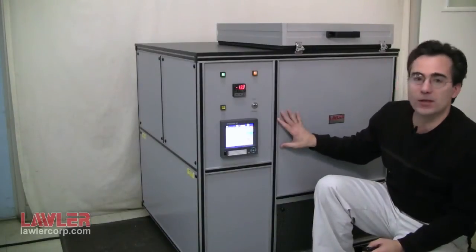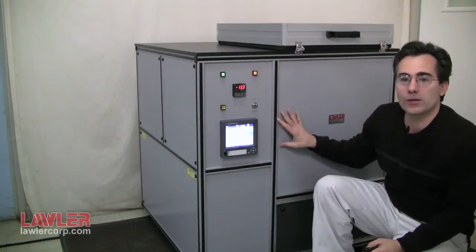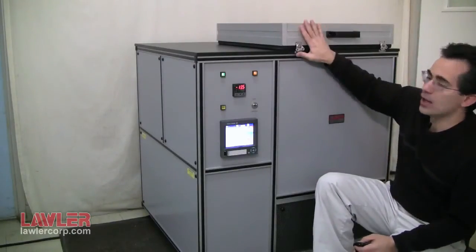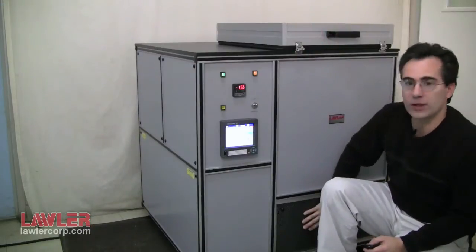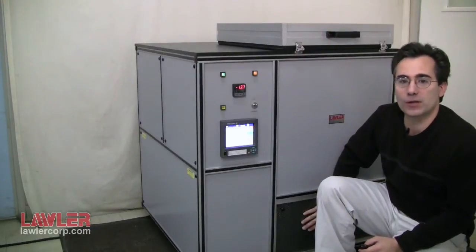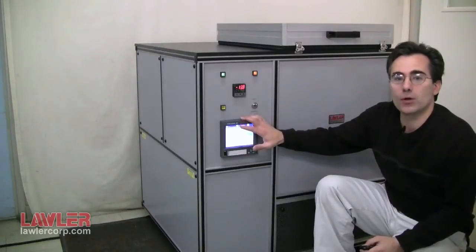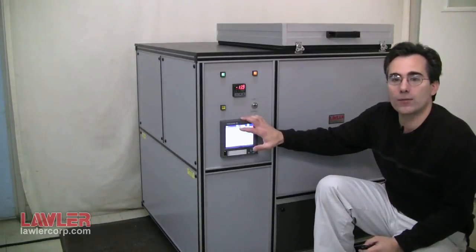Hello, the instrument behind me is the Lawler Low Temperature Torque Tester. It's the single position model. It features the air chamber itself. The lower deck has the refrigeration compressors and assembly. There is a digital paperless video graphic chart recorder for logging of the load cell and the bath temperature.